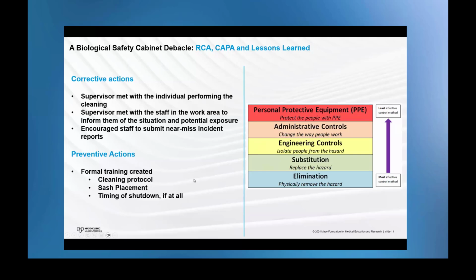Something else to consider in the interest of making safety something we do from muscle memory is to revisit this case periodically. Perhaps your team has huddles. Perhaps you do tabletop drills. All of these things take time, so I recognize that it can be challenging to come back to. But paint the picture for your staff. Maybe it wasn't even your work unit where it happened. What would you do if it happened? Ask that question. See what answers crop up.